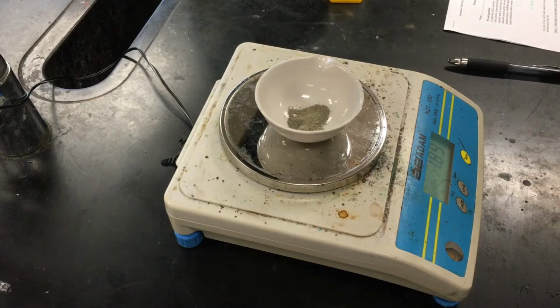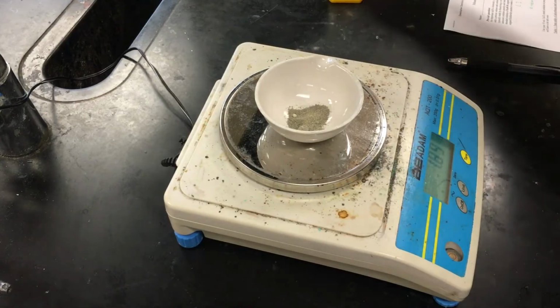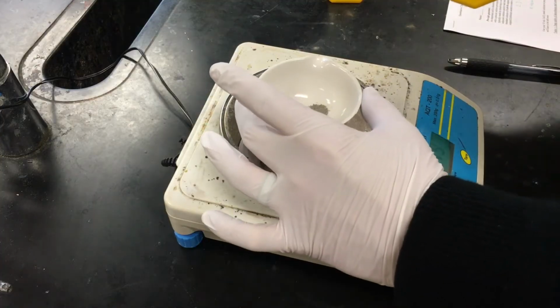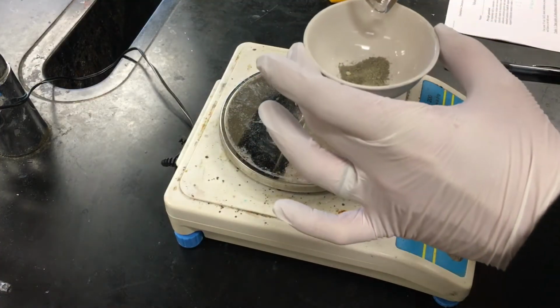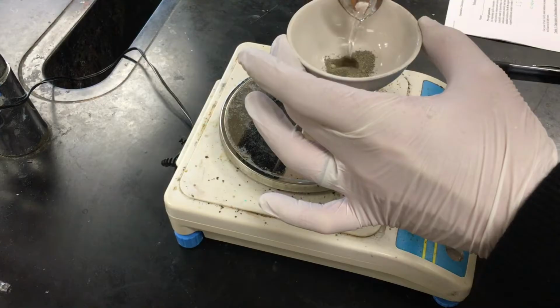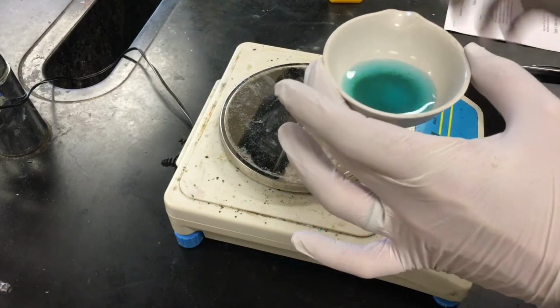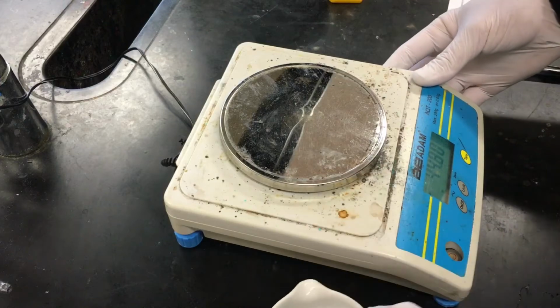So we're not adding 35 milliliters of water, we're making 35 milliliters of solution. So we're going to need a little bit less than 35 milliliters of water. So we're going to start by pouring some water in here.